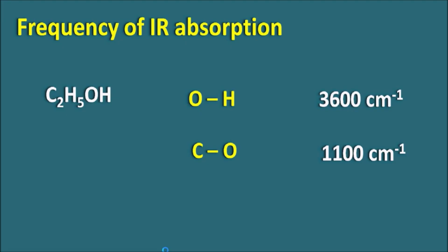So that's for today about the principles of IR spectroscopy. For a molecule to show the IR absorption, it should undergo a net change in the dipole moment.